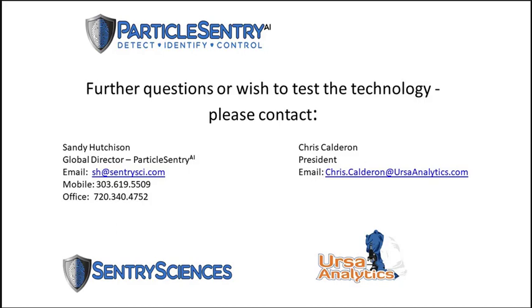That doesn't really matter too much. It's a matter of, we like to try to use lossless formats. I mean, the FlowCam uses TIFFs. That's where we extract from. But you just need to be consistent with all the images.